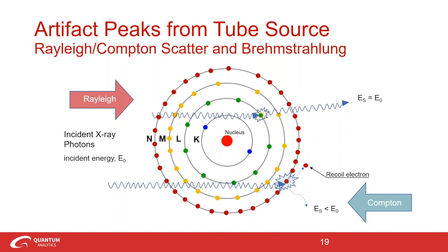And then you have this great word, I love to say it, Bremsstrahlung, right? Or continuum radiation. This is a German term for braking radiation, and it appears in spectra as very broad peaks due to backscattering of X-rays from the sample to the detector.